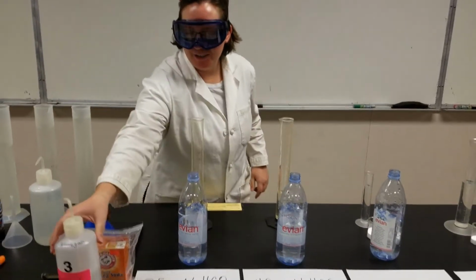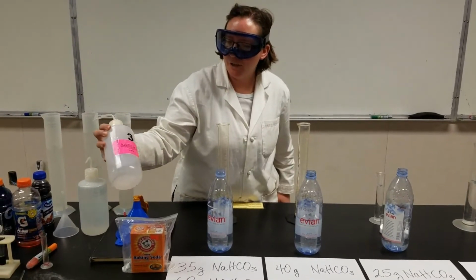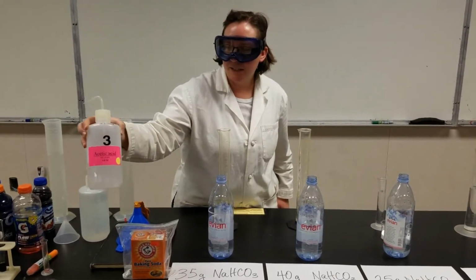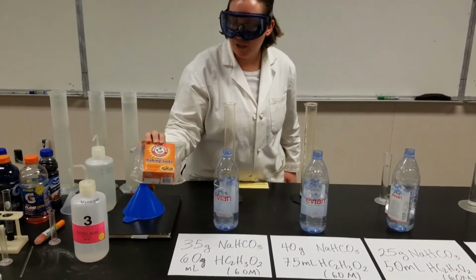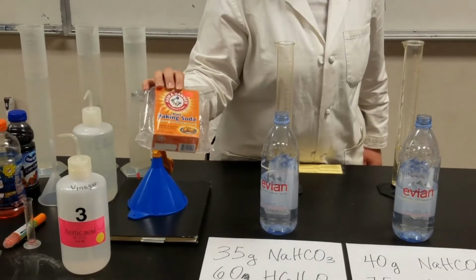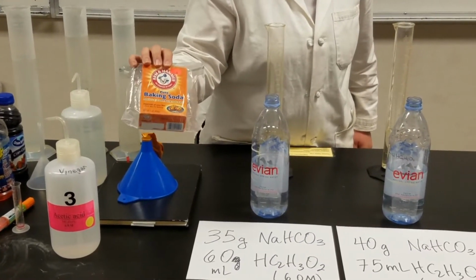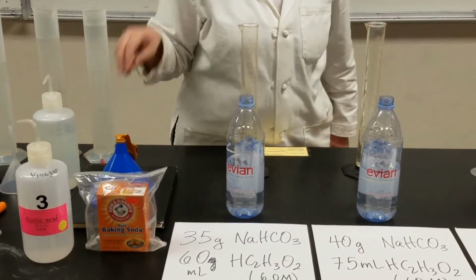We have our vinegar. This is a substitute for vinegar. It's 6 molar acetic acid. We have household baking soda that you would use, and the function of baking soda in your kitchen is maybe cleaning, but also to make your pancakes rise. So that's what we're going to do with these.